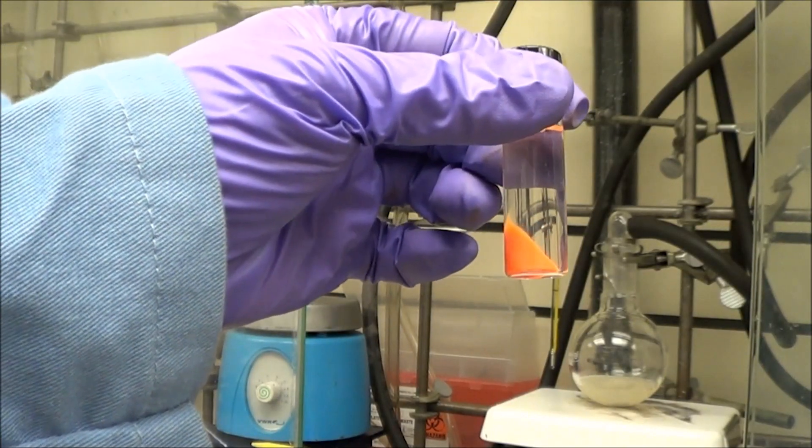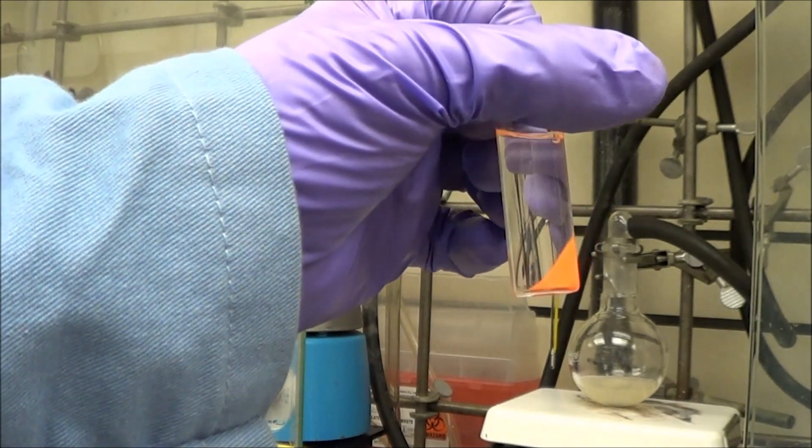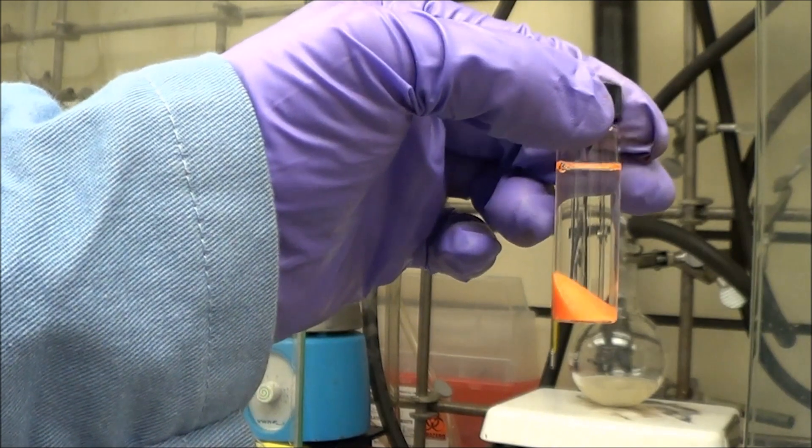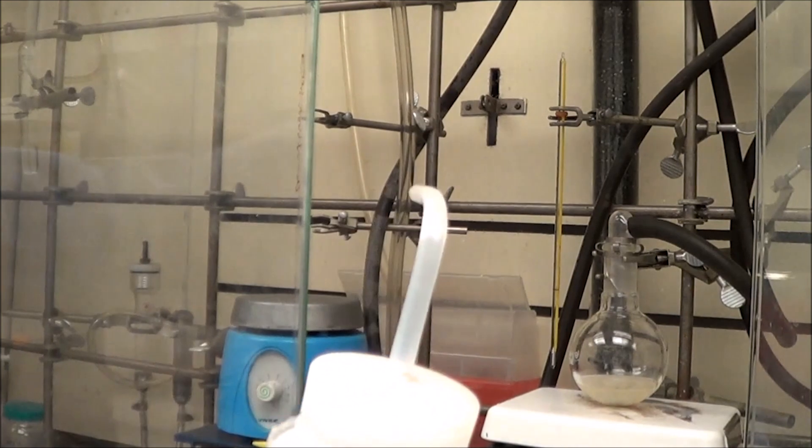For cadmium selenide, the supernatant is clear, but you can see that actually those mostly aren't quantum dots, that's a paste. That's an alkylamine phosphonic acid paste that I've got to extract the quantum dots from, they're embedded in it.